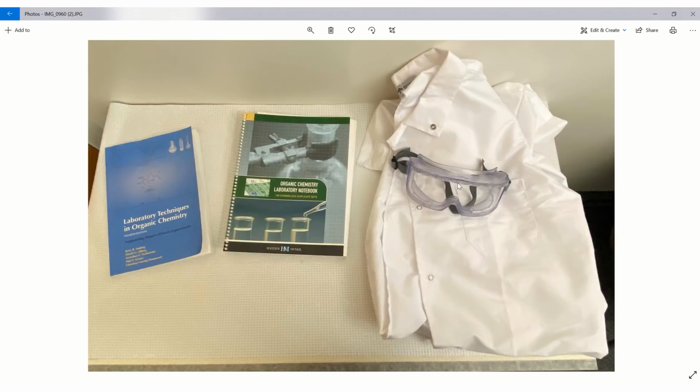And then the goggles and lab coat you can buy at the Nichols building, which is the building attached directly to the north end of the central wing of the Benson building. These can be purchased for probably $20 or $25, not each, but combined. And this particular type of goggle is the one that you want. It's designed to fit snug up against your forehead and cheekbones so that any chemical splashes don't run into your eyes.